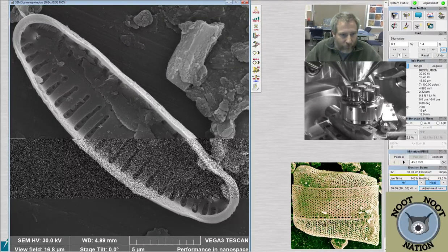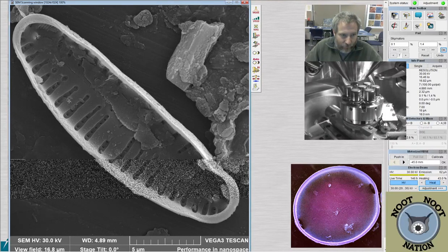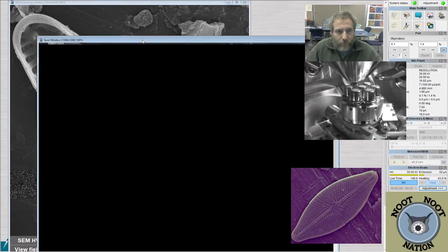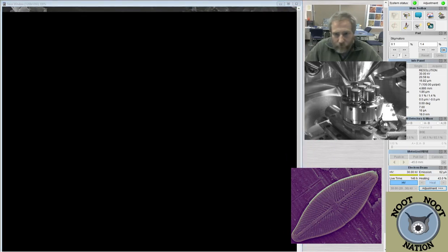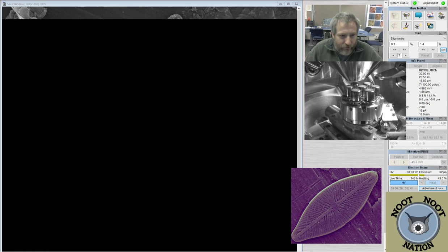So the species are usually determined by the shape, the outline, and how many of these little holes are in each one of these striae or little chamber-like structures you can see here. So, yeah, you got it? It's a pretty diatom.